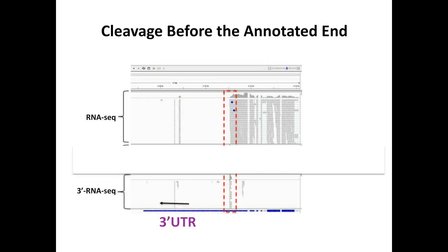So obviously this gene model would also be wrong. It needs to be shortened. It is the opposite of what we just talked about. This gene in the database is longer than it's supposed to be. So we also fixed this problem by finding where the end of the transcript is and cutting there, reducing it to the smaller transcript.